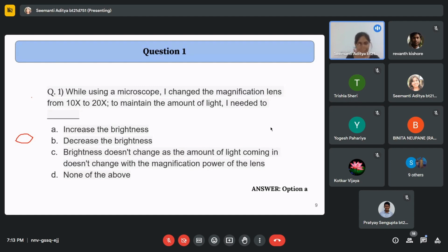Apart from that, maybe the water that we are using also gets dissociated or something, from where we can get oxygen. So yeah, oxygen inside the incubator is already present. Just like in normal air we have oxygen, so we have air there.